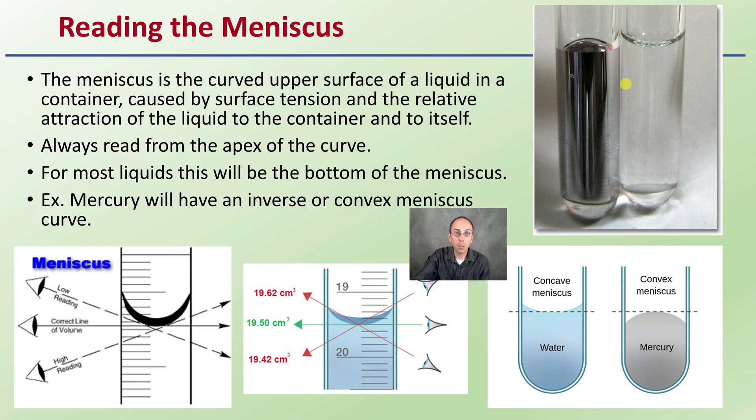If you're working with mercury — which probably you won't be, but I just wanted to let you be aware — the meniscus is actually going to be the opposite, as we can see in this image. Mercury has a meniscus like this; water has a meniscus like this. Most of the time you're going to be reading from the bottom of that apex, but with mercury you read from the top. You always want to be reading at eye level.